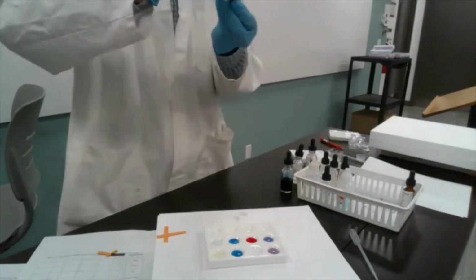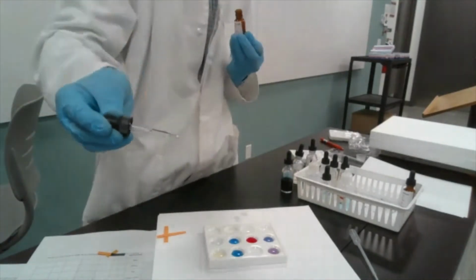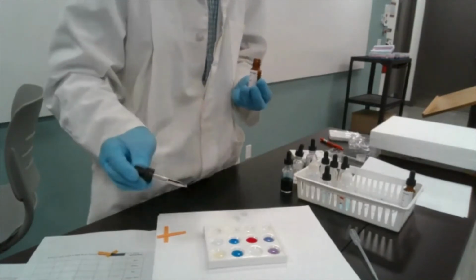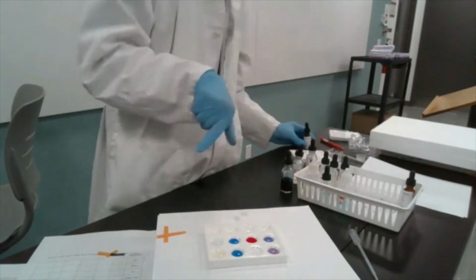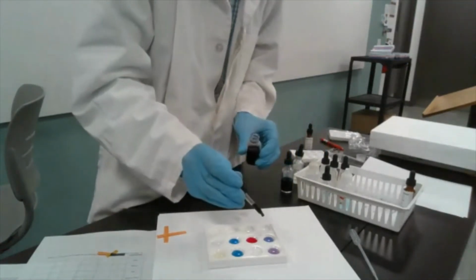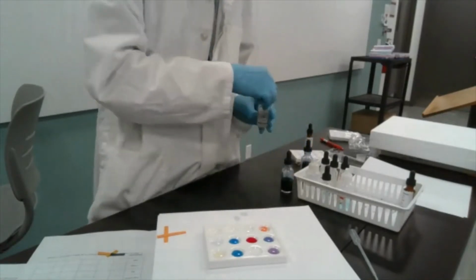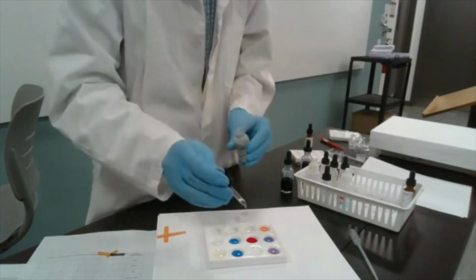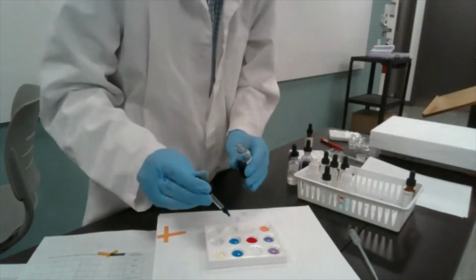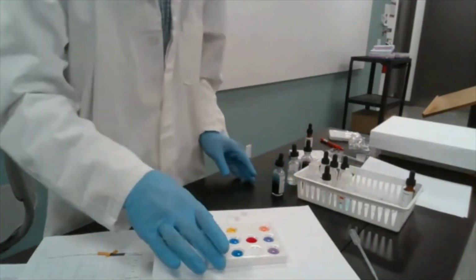Next is hydrochloric acid. Hydrochloric acid is also a colorless liquid by itself, nothing remarkable about it. But when we mix this acid with our indicators, we'll see what happens. I've already added acid there, but let's add the indicator. So I'm going to add the litmus first. Then I'm going to add phenolphthalein. And then the bromothymol blue.